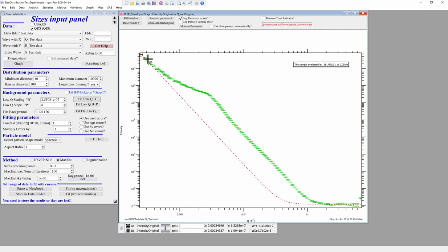So now what we did is we have underlined the data with our presumption of the background. Keep in mind, this will impact the results which you have. And so a typical thing in publications is you should really have a justification for what you have done here. If you send a paper for review to me, I will ask, why did you do this and not something else? Because without justification, you just cooked up some garbage data. Anyway, so the next step is we can select the range of data with the cursors from here to there. These are the data which are dominated by the scattering of particles which you want to analyze.